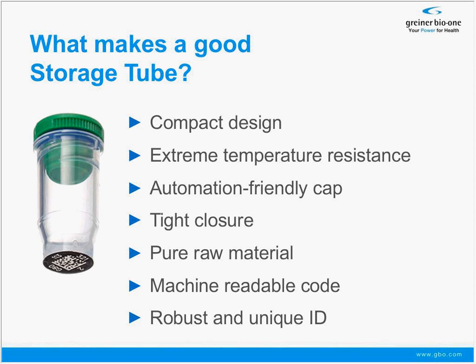There's nothing that needs to be added. We just looked at temperatures. We stated -80 and even -196 are storage temperatures of interest, and the tube should simply fulfill this criterion. But it is challenging to the material and also to the closure of the tube.